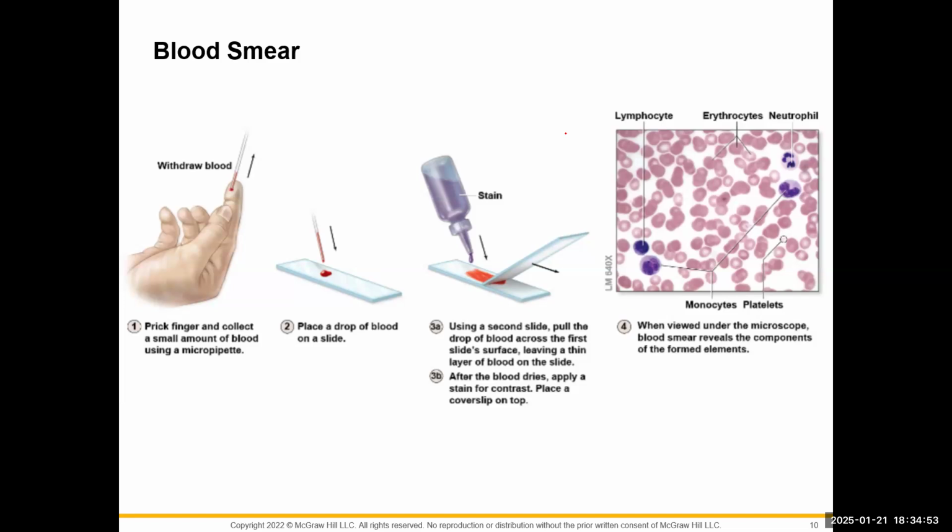Here you can see to the right on our screen what a normal blood smear should look like. You can see how numerous the erythrocytes are. You can look at the cell characteristics and notice that the center of those cells is pale in comparison because they are much thinner. Those bigger cells that look blue-purplish are the leukocytes, your white blood cells. Then you'll see these smaller little fragments of cells throughout the sample. This one doesn't have very many, but you can see where that one circle is on the lower right side of the picture. You can see one of the platelets there.